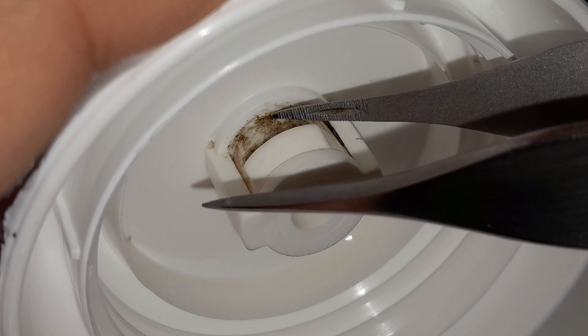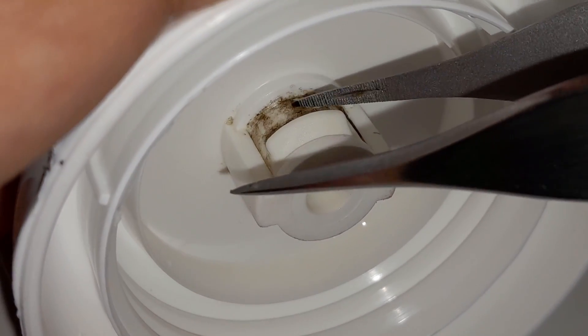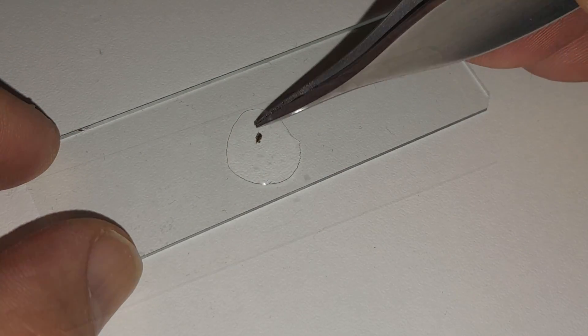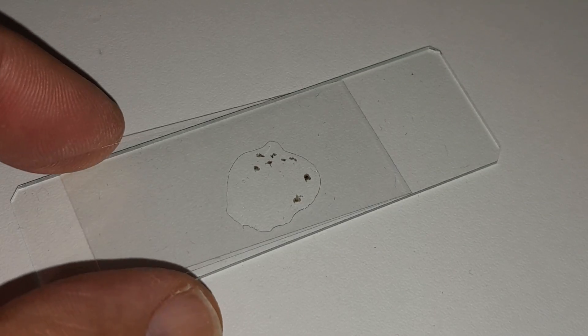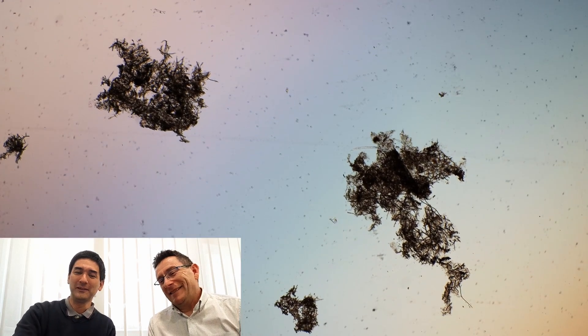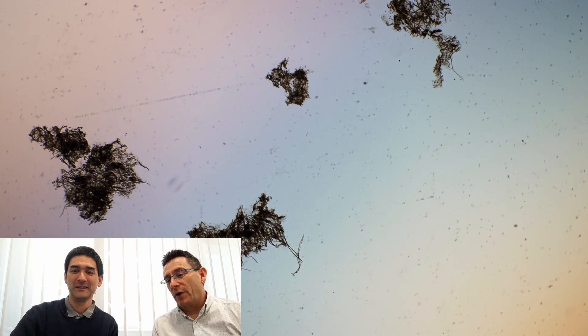I assumed it's some sort of bacteria or fungus. I put it under the microscope, and here on my laptop I've got the footage and we're going to have a look at it together. I'm going to press play — look at this! Do you see those things here? It looks like a fish tank. What do you think those black little patches could be? It looks like what was growing on the walls of my fish tank as a kid — some sort of algae?